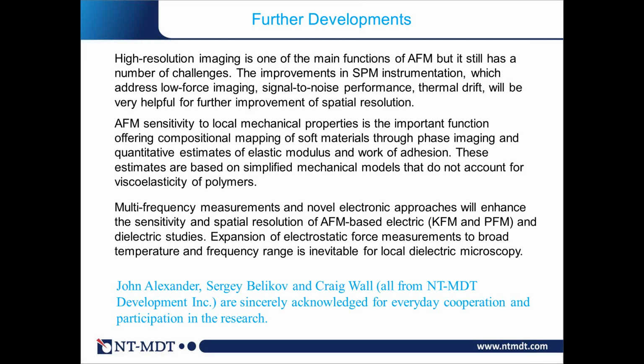We have a question from the audience. They want to know, how can one measure real properties, topography, adhesion, dissipation, of soft samples like human cells in solution? The comment is, the main problem for normal imaging is that high force should be applied so that you get a crisp, clear image.